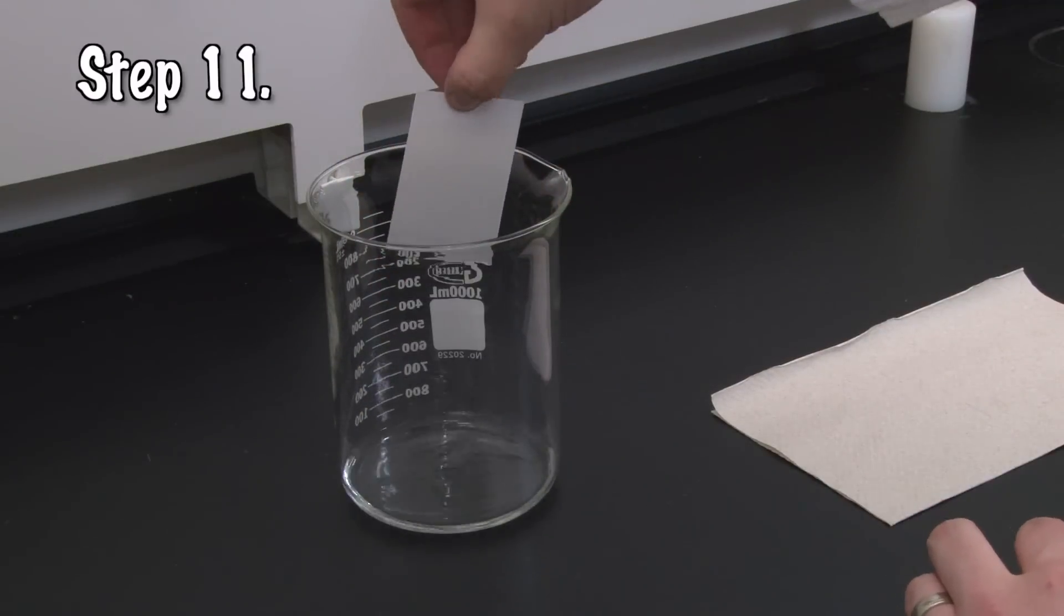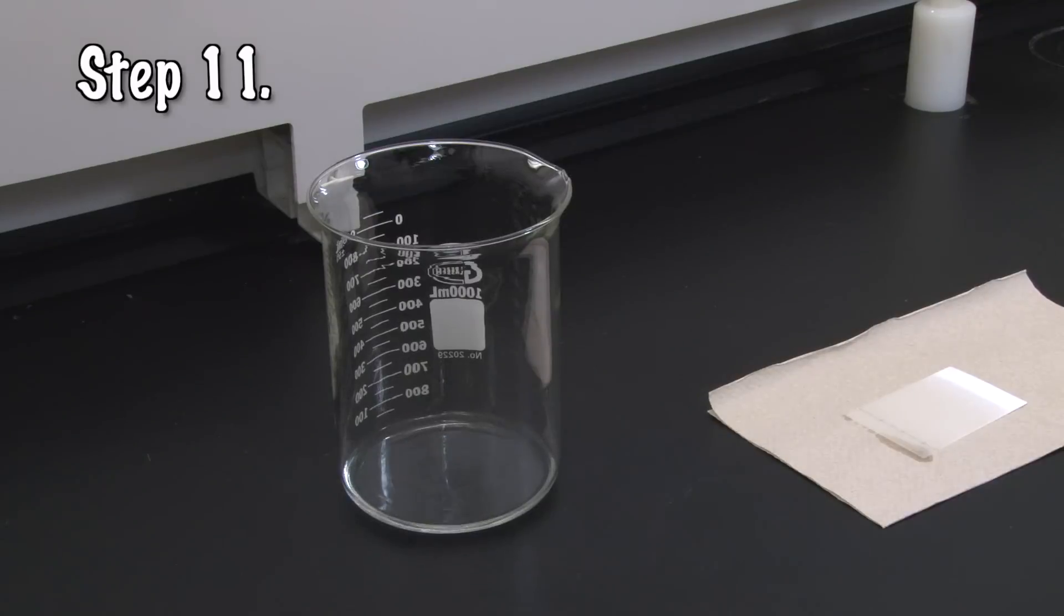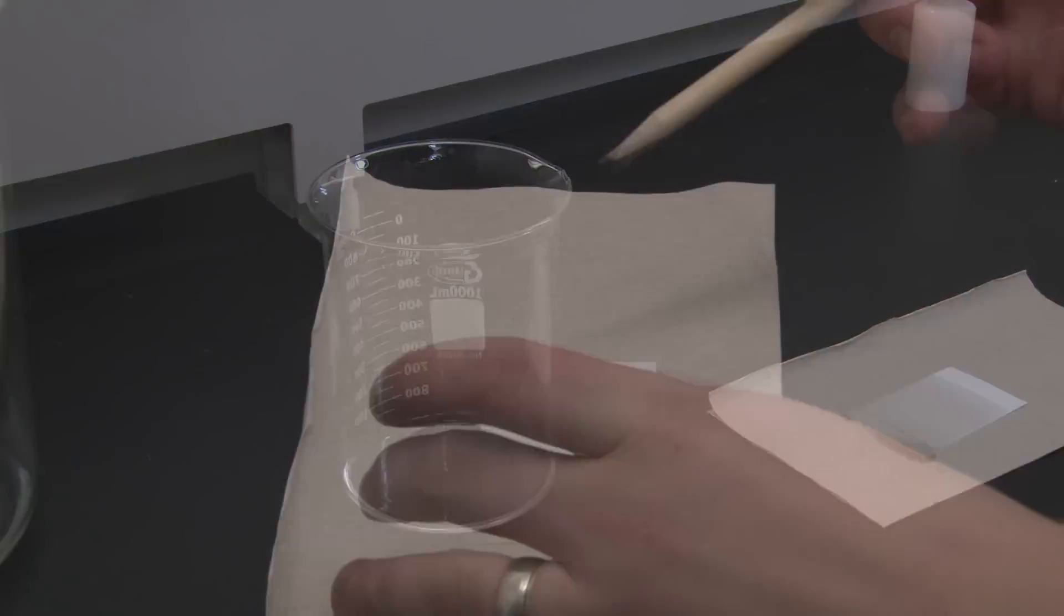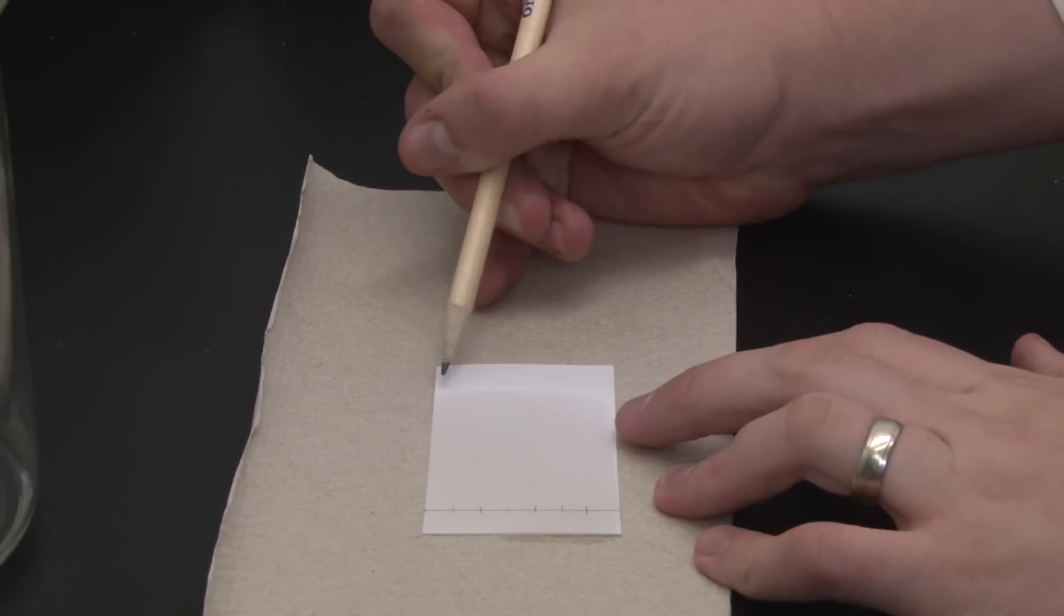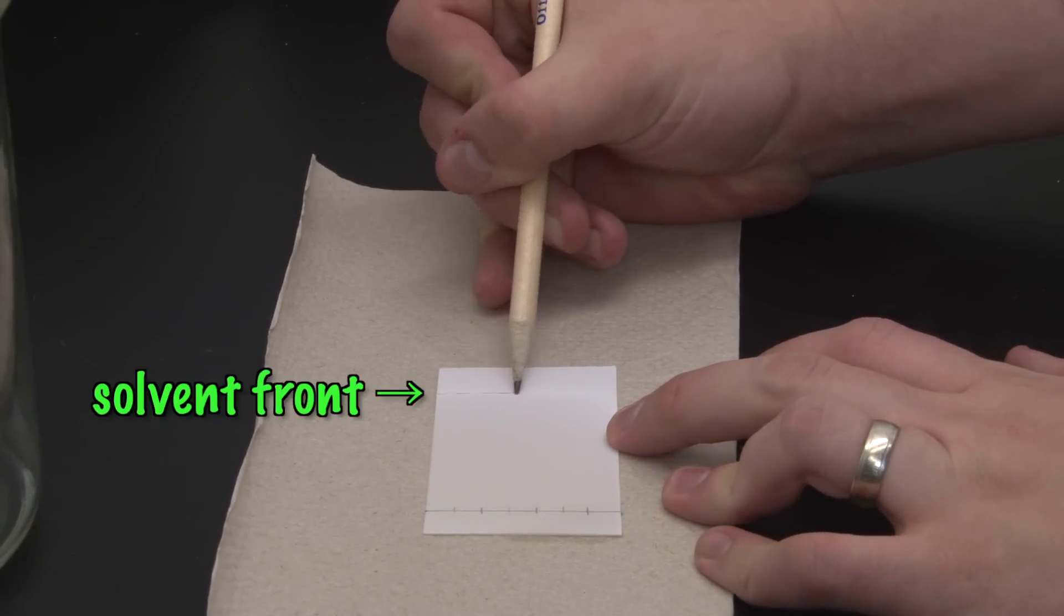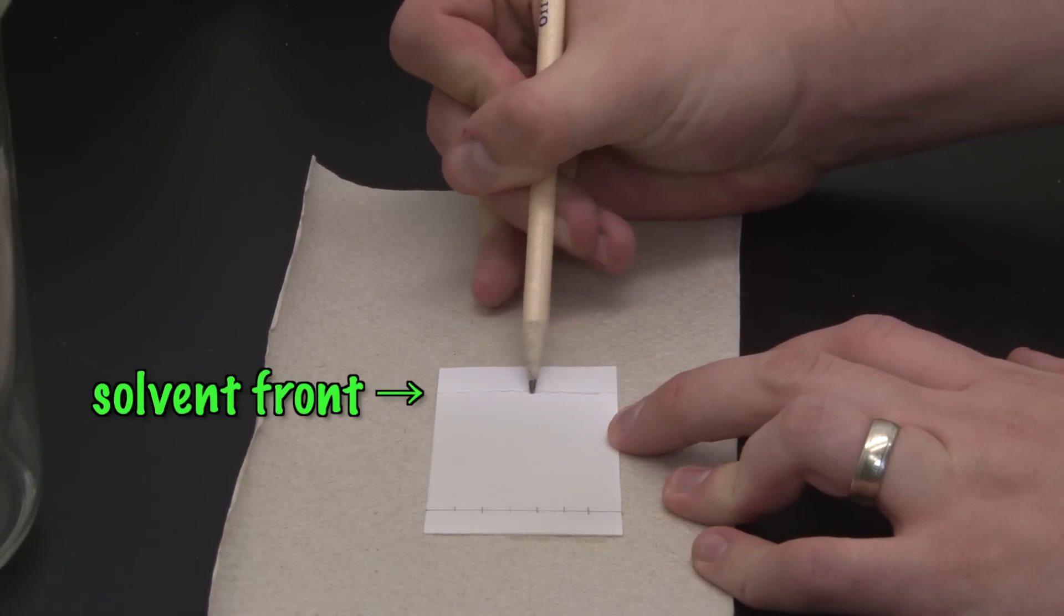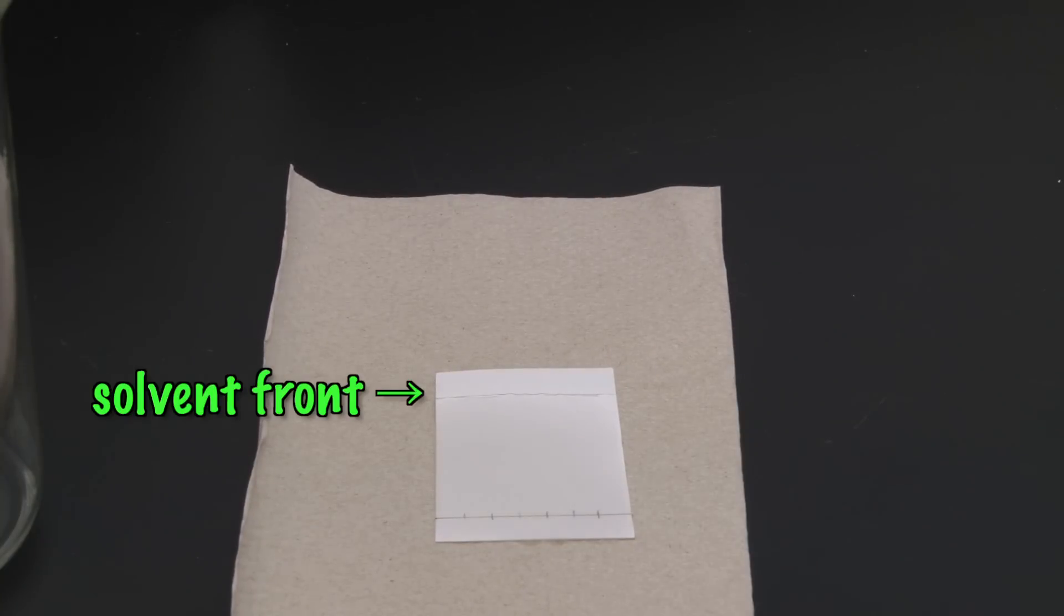Remove the TLC sheet once the solvent has made it up to about one or two centimeters from the top. Place it on a paper towel and use a pencil to mark the solvent front. We'll need to know later how far the solvent traveled, so be sure to mark it before the solvent evaporates. Leave your sheet under the hood for a few minutes until the solvent has evaporated and your sheet is dry.